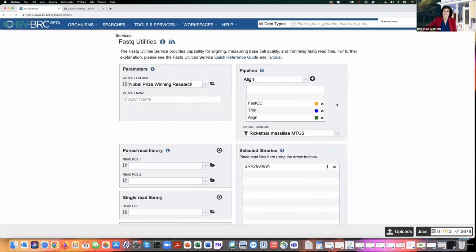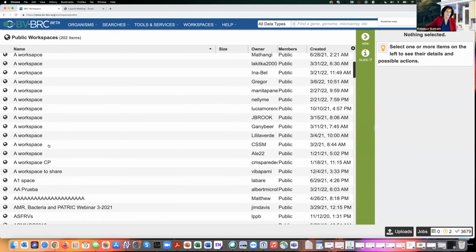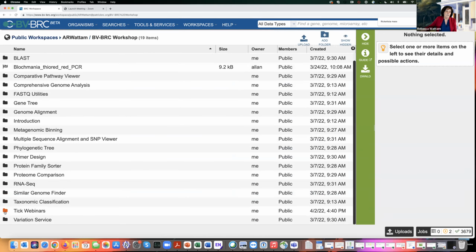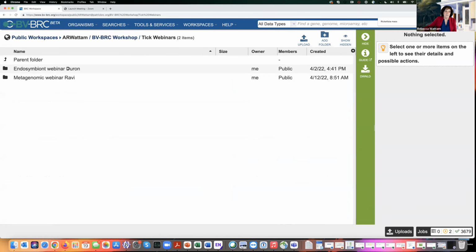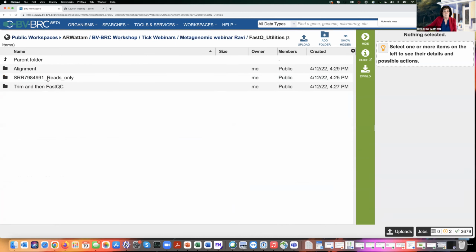But like I said, this is like a cooking show. I already have those jobs available for you. So let's go into public workspaces, under workspace, scroll down to BV-BRC workshop, scroll down to tick webinars. And this was the first webinar I gave. This is the second one. And now we're in FASTQ utilities. So let's click on that.